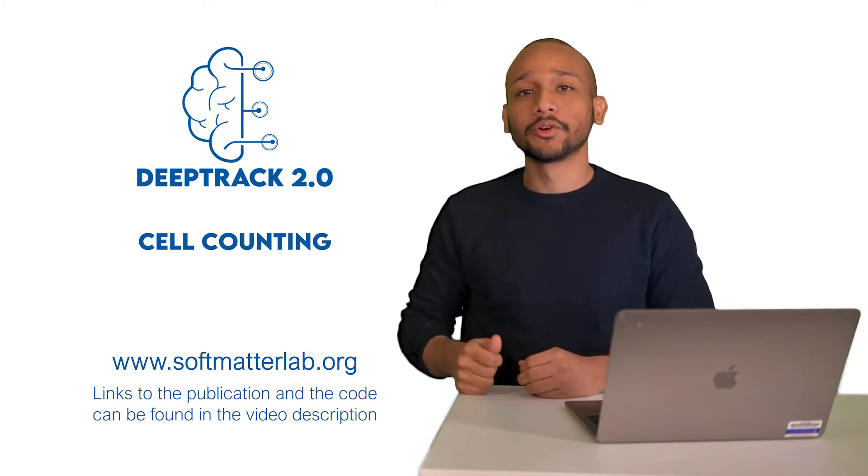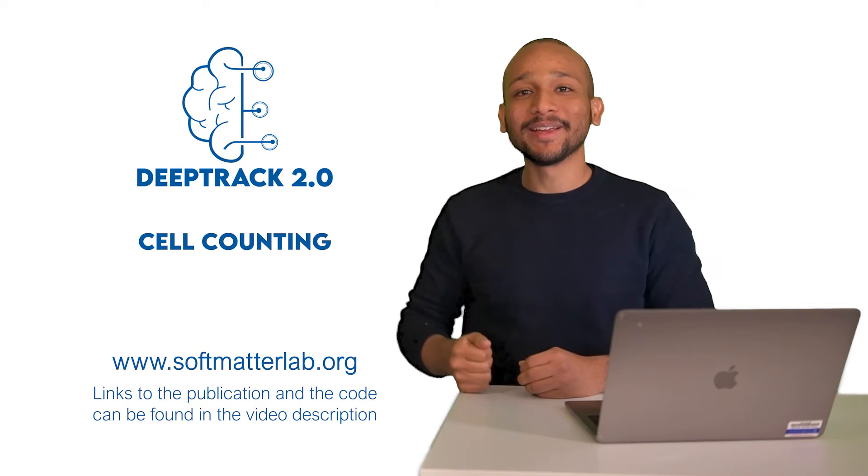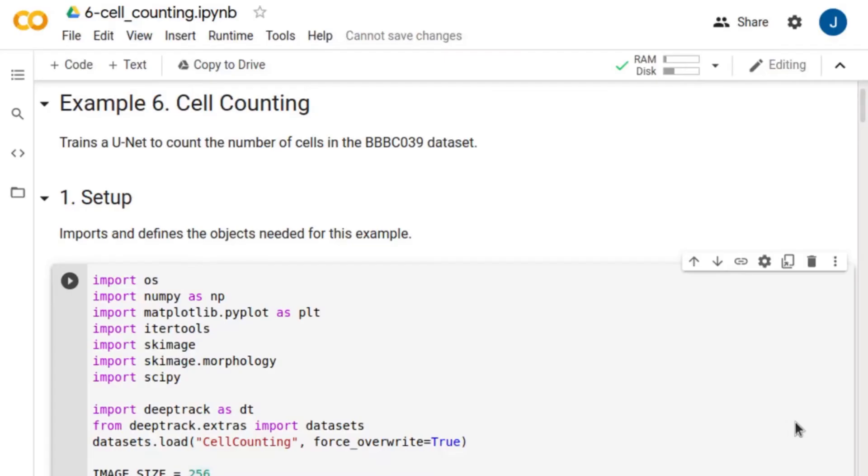In this tutorial we are going to use DeepTrack for cell counting. Hello, I'm Jesús and I'll be your guide for this tutorial. Let's go through example 6, where we use DeepTrack to train a U-Net network for cell counting.